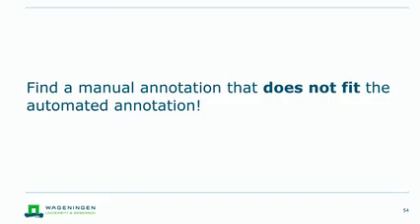Of course I want to sell the tool a little bit, but I also want you to use it in a manner that you will maybe find at home or in the lab. If I show you only the good examples and then you see, oh, it doesn't work like that, then that's also not what I want. But in general, it aligns quite well.